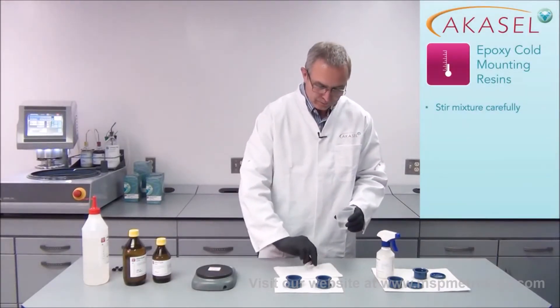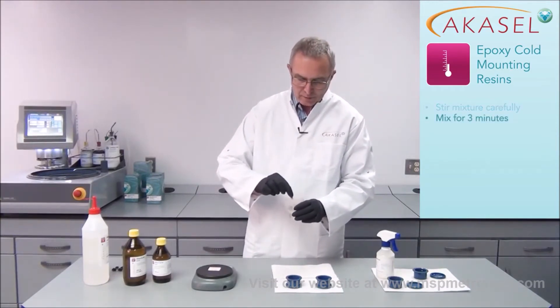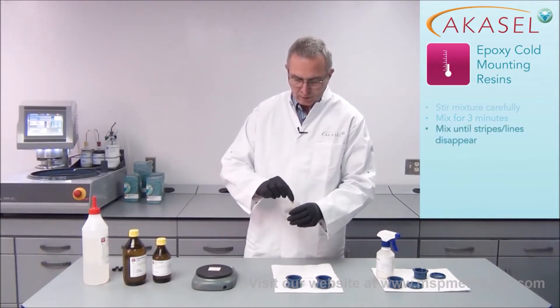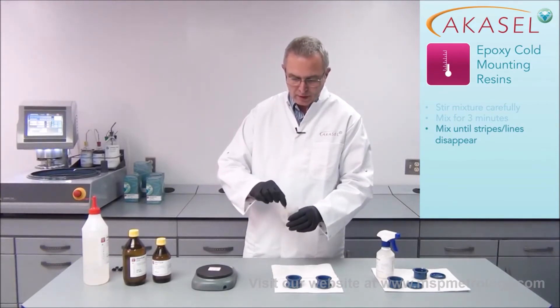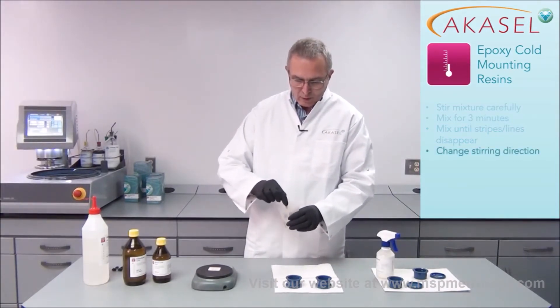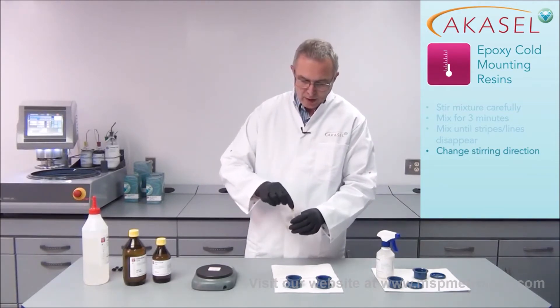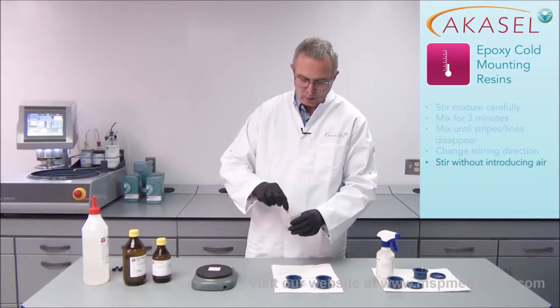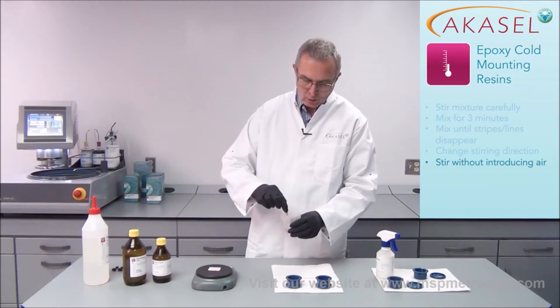Stirring is very, very important and I have to be thorough — I have to stir for about 3 minutes. In the beginning you may see flotation lines showing up, and you have to stir until they are completely gone, because only then are the resin and hardener mixed thoroughly. While mixing you can change the direction of rotation for a better result, but you should not mix too fast because otherwise you will introduce air bubbles that will stay in the finished mount.